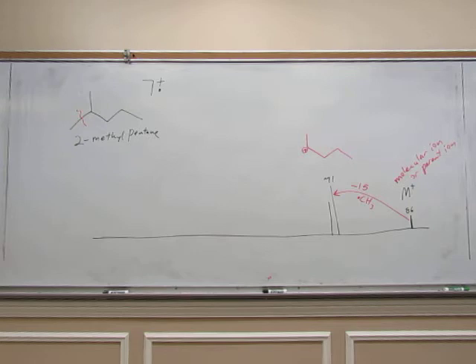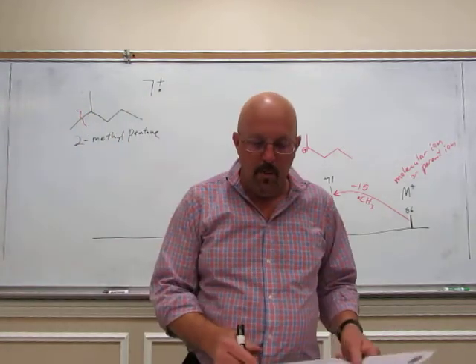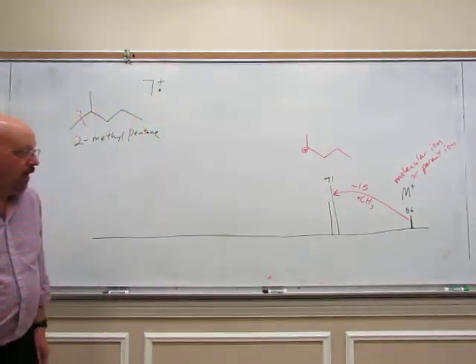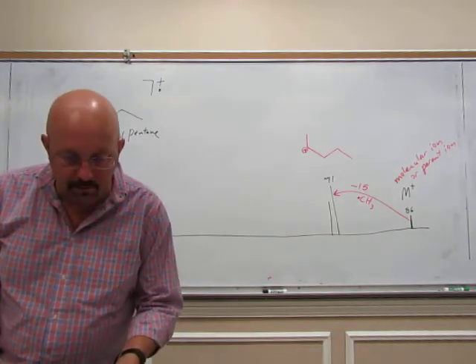And finally, I'll do one more, 57. That's a butyl radical. Now again, I'm just going to write this as C4H9 because that radical could be on different carbons there. That's a butyl radical. Okay, so that's some common losses. And if you learn those, they'll really help you with interpreting the spectrum. Now, let's see what else we have here.